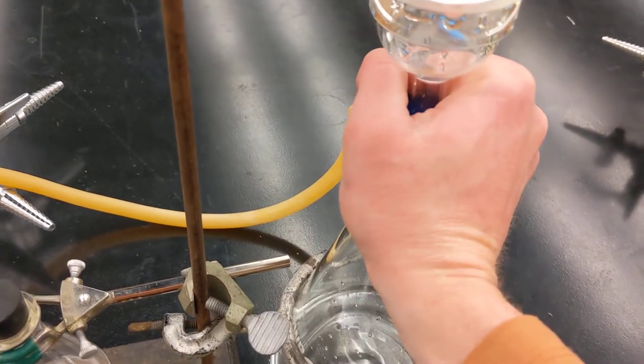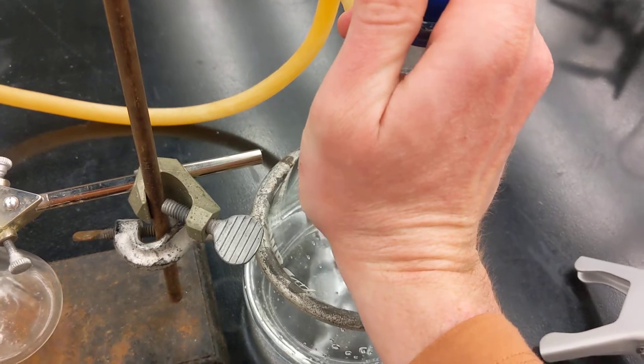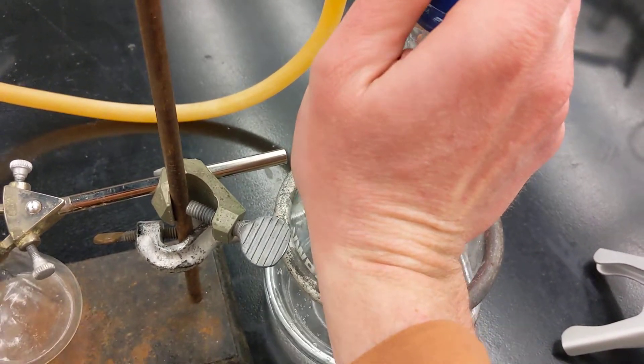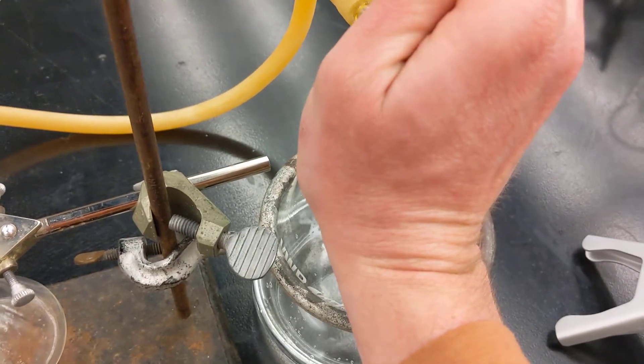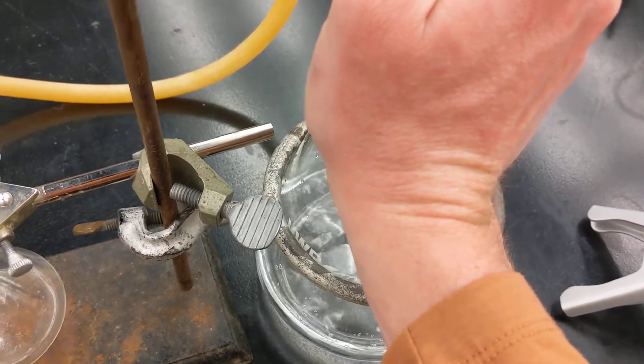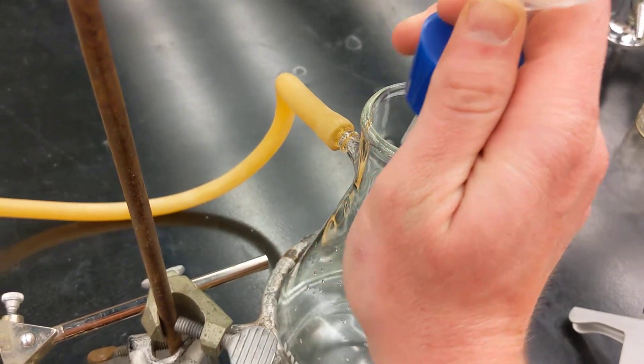Now you can very carefully remove the septum. There should not be a vacuum in here to remove this. Slight vacuum. Okay, remove that. I'm going to place this upside down.